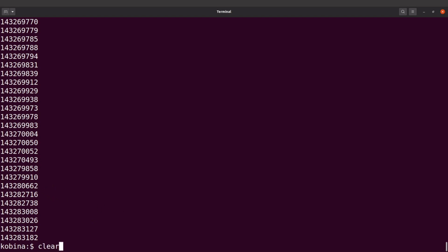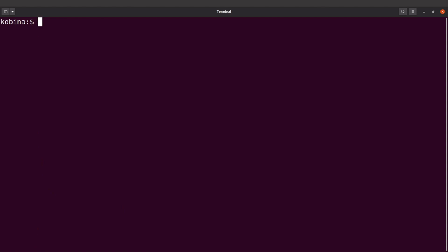So we are going to modify this command again. So we'll say BCFTOOLS query -f, bring our quotes, and then we have Chrome. That's the first one. So if you want to separate them, you can use any character of your choice. You can use a tab character, or you can use comma, depending on what you want to achieve at the end of the day. Now let's try with the tab first.